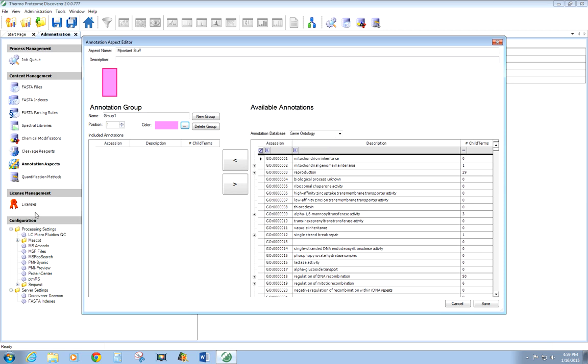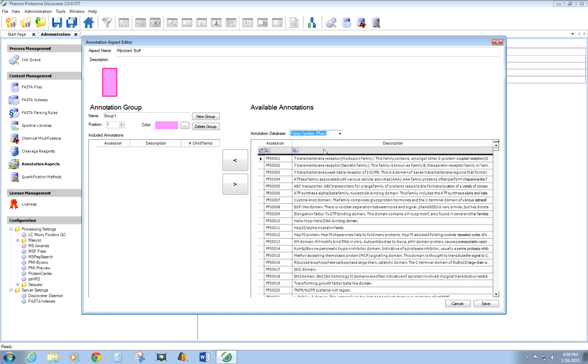I'll say, look, group 1, I want it to be labeled hot pink. So when I see things, and I can look up things through gene ontology or through protein families, Entrez, PFAMs, I want to click on that and say, okay, important stuff to me is anything that shows an HSP20 domain. Click on that, add it over. Oh, it's got an SH2 domain, that's important too.